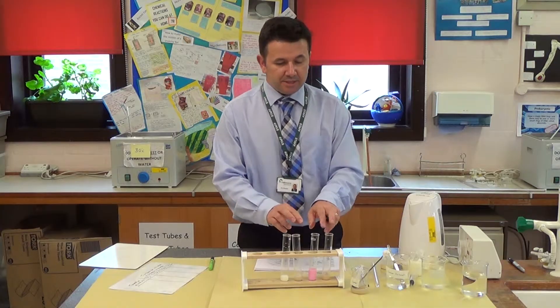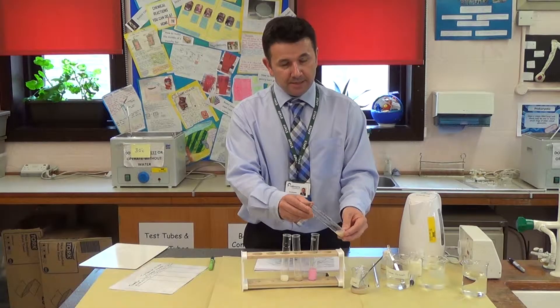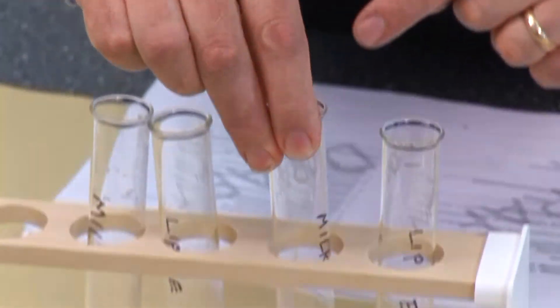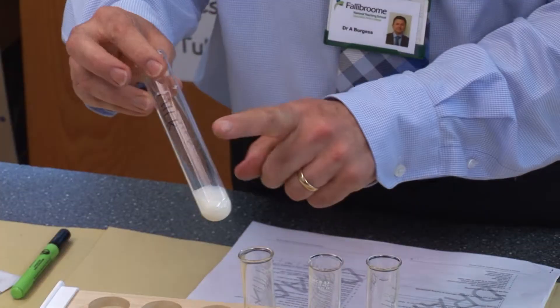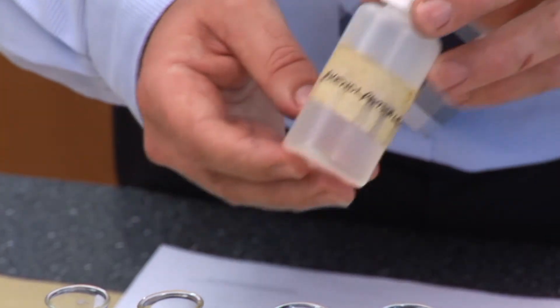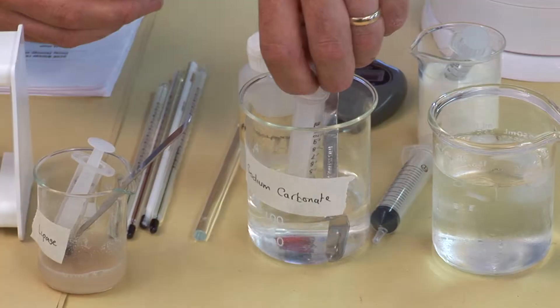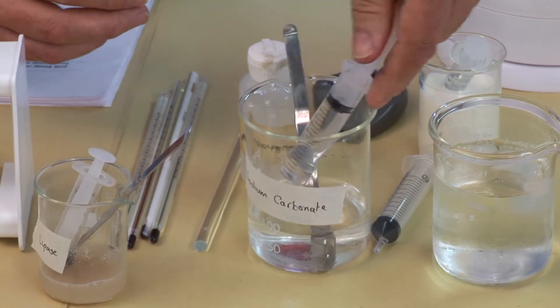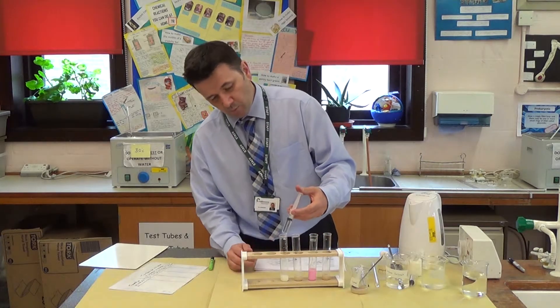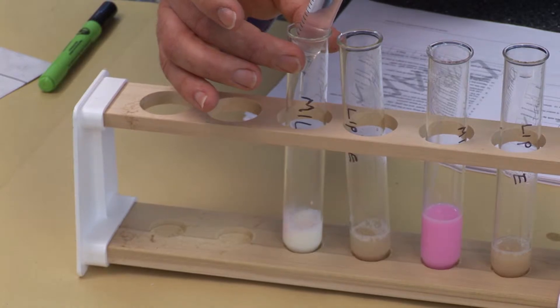I've set up these four test tubes — one is labeled lipase and the other contains milk with other things in it. You measure out some milk, then add five drops of phenolphthalein, and then add an alkaline solution. I'm going to add sodium carbonate into here. What it will do is go pink, because phenolphthalein goes pink in an alkaline solution.